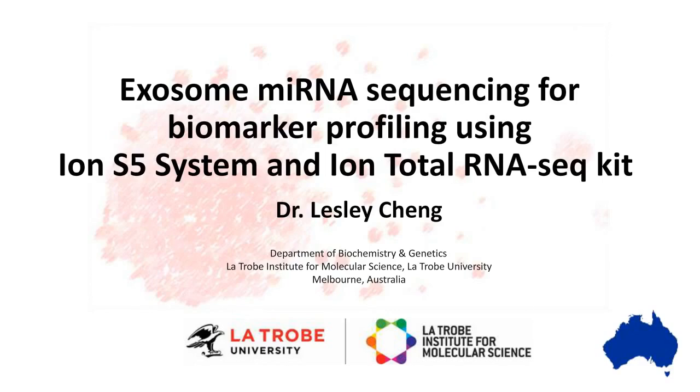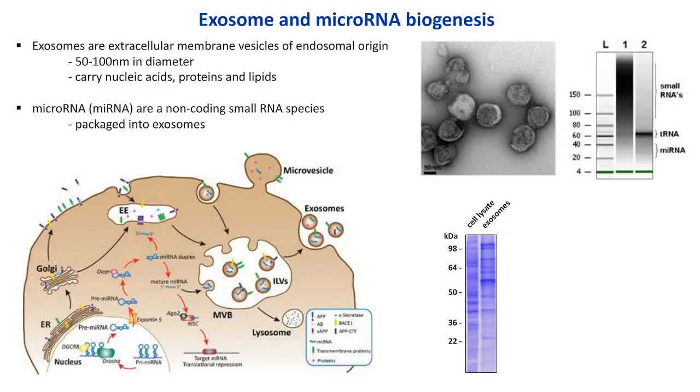Hi everyone, thanks for joining us today on this webinar. I'm assuming that if you are here today, you're interested in performing small RNA sequencing on the Ion Torrent platform, and perhaps you will also be profiling exosomes. A lot of my research does focus on exosomes. They are an extracellular membrane vesicle of endosomal origin. As you can see from this EM image, they are about 50 to 100 nanometers in diameter. They carry nucleic acids, proteins, and lipids.